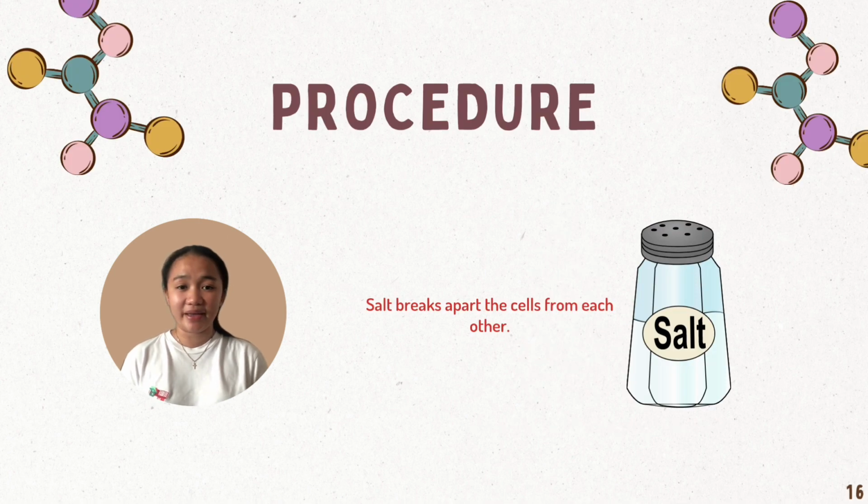The salt was added to break apart the cells from each other and to neutralize the DNA charge and make the molecule less hydrophilic, meaning it becomes less soluble in water. The salt also helps to remove proteins that are bound to the DNA.